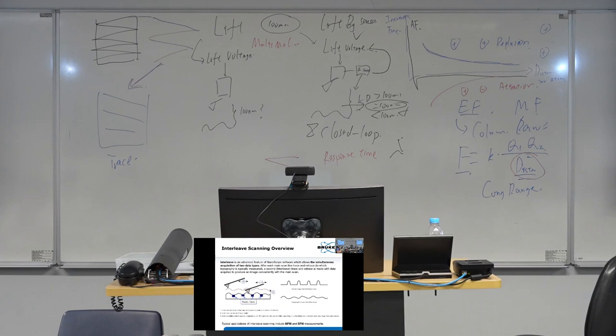The first is on the surface, and once it scans the surface, the system will remember the trajectory of this main scanning. And then on the second scan, the lift scan, the probe lifts above the surface by a defined distance and follows the same trajectory as our first scan. As such, the distance between the tip and the surface is a constant, equal to the lift height, right?